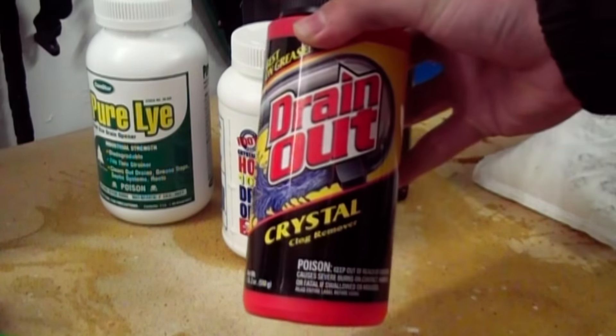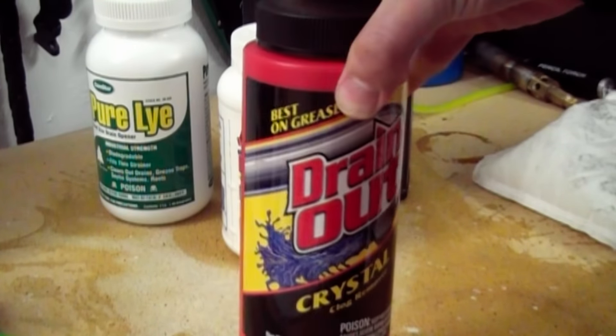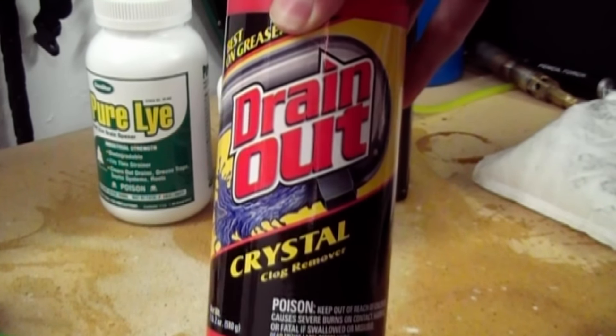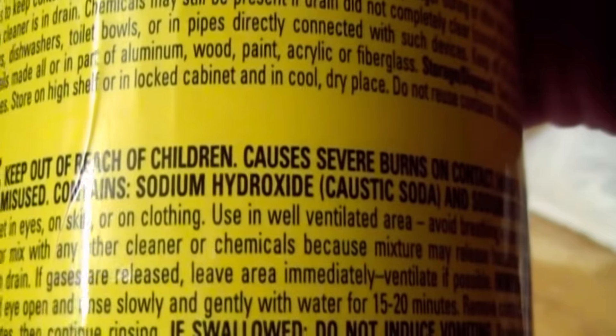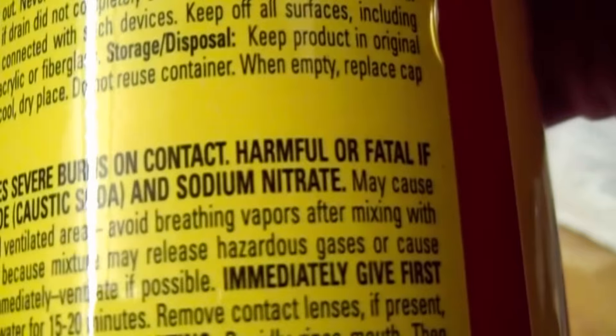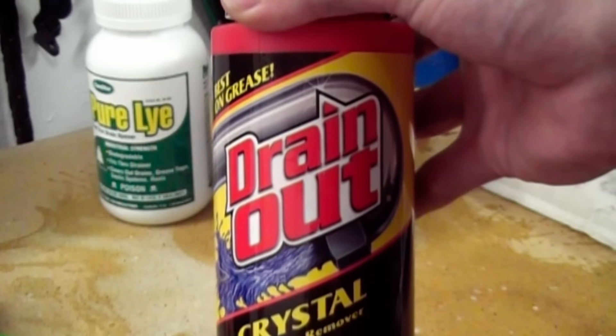This product was purchased at Walmart and was attractively priced, although examination of the label indicates it has sodium hydroxide as well as sodium nitrate. This cannot be used.